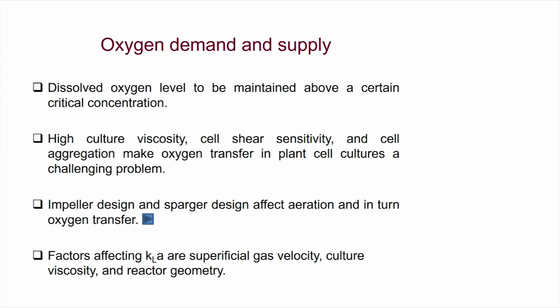On the basis of what I spoke about, these factors will be affecting KLA. You will find in literature enough empirical correlations between mass transfer characteristics and various operating parameters of the reactors, for example impeller width, impeller diameter, superficial gas flow velocity, and power input to the impellers. These are some of the parameters in the reactors which have been found to be related to the mass transfer coefficient of that reactor vessel.